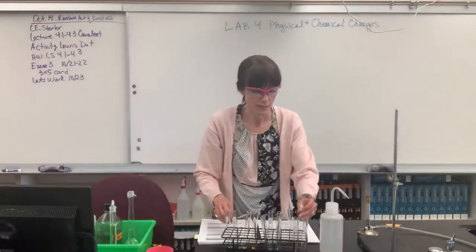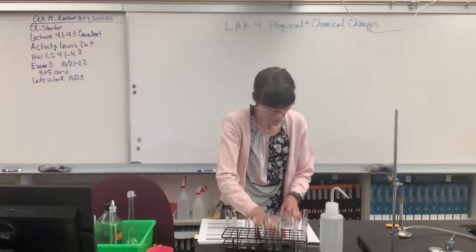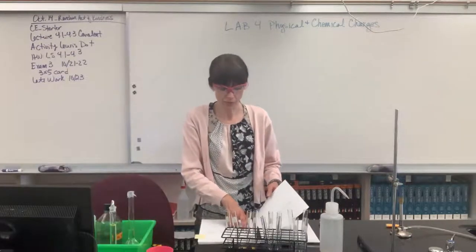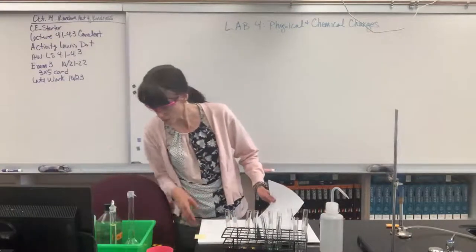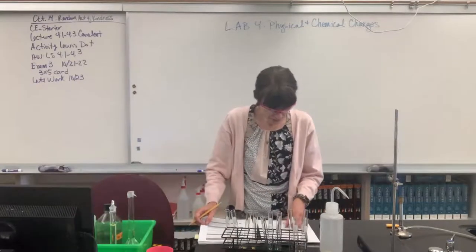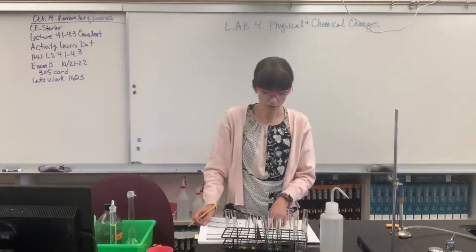Let's record that. So I'm going to put this off to the side. If you will please go to page 53, it says color of the flame, original solid. You're going to put down yellow. I'm going to write that as well. We'll do this together. So that was a yellow flame. Okay, next it says note the color and record under solid original.